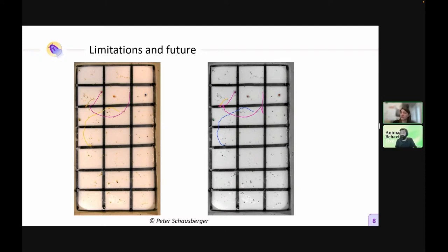Yes and no. For instance, in the video that's displayed now, you can see that the ID is maintained. There are 6 mites and there is no problem. If I have the video of the 10 ants in which I wrote that there was a focal individual, there is no problem. But there might be identity swaps. If you have an identity swap, the program won't correct it by itself, like idtracker or TRex, programs that include identity corrections. AnimalTA doesn't have identity correction.